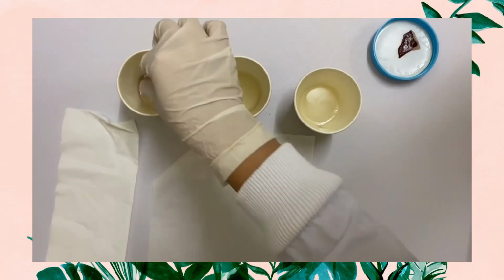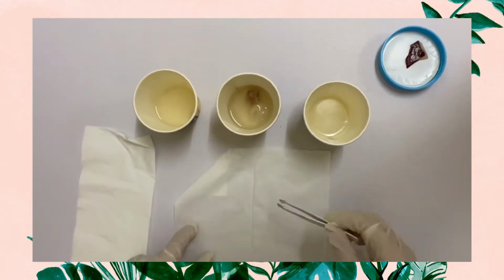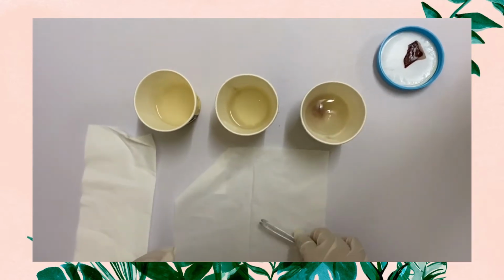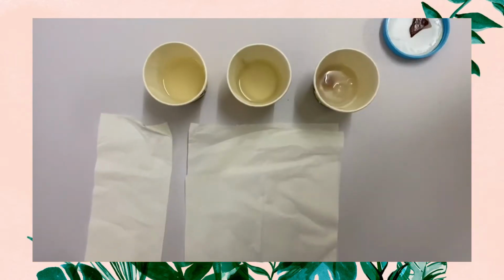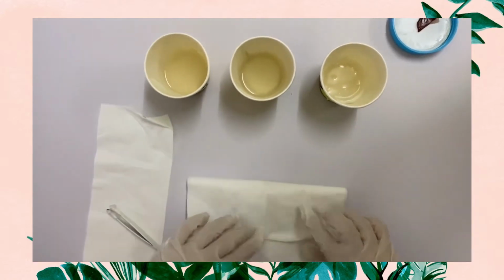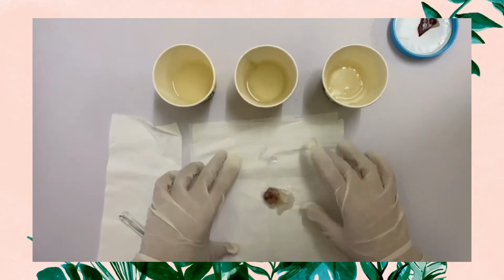One eternity later. And for the second paraffin wax bath, 30 minutes. Three days later. And for the third paraffin wax bath, 45 minutes. Twelve seconds later. Remove your tissue sample from the wax. Place them on paper towels. Prepare your tissue for embedding.